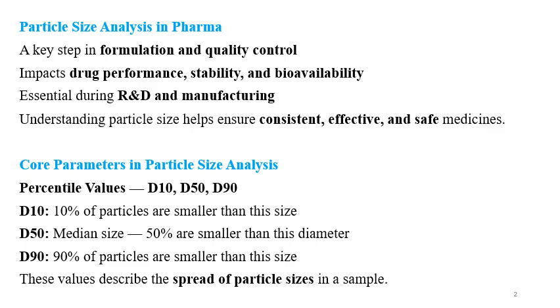Understanding the particle size helps to ensure that the products or medicines developed are effective, safe, and consistent. The manufacturing process gets affected by the particle size.